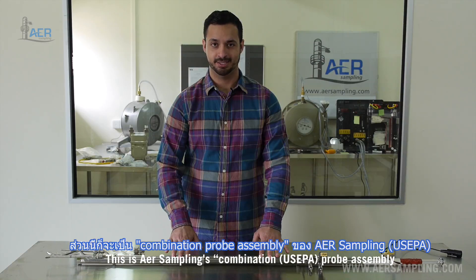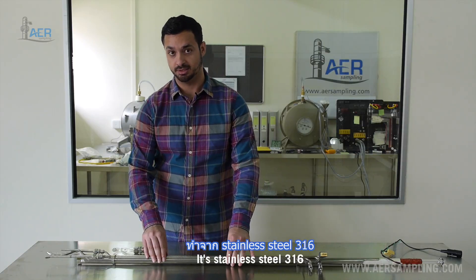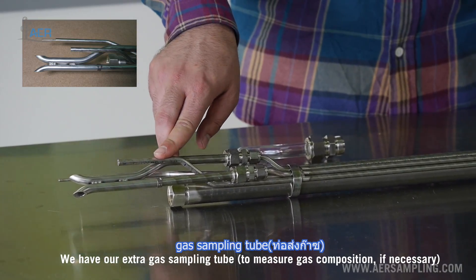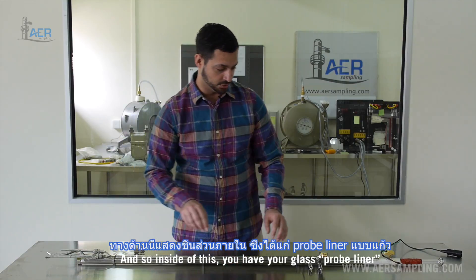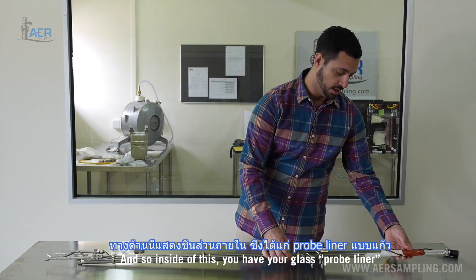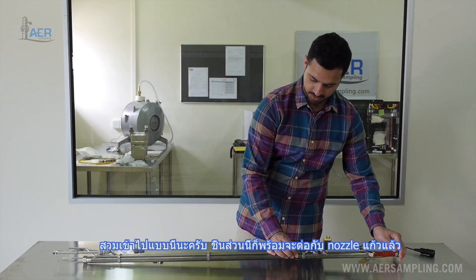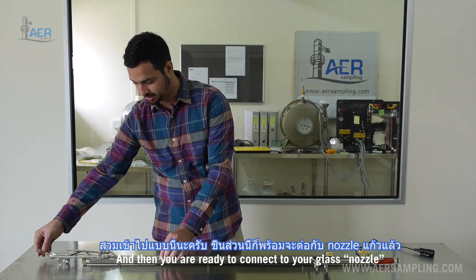This is AER Sampling's combination probe assembly. It's stainless steel 316. We have our S-type pitot tubes, our extra gas sampling tube, and our thermocouple. Inside of this you have your glass probe liner and a heater assembly as well. These just slide right in together, and then you're ready to connect to your glass nozzle on this end.